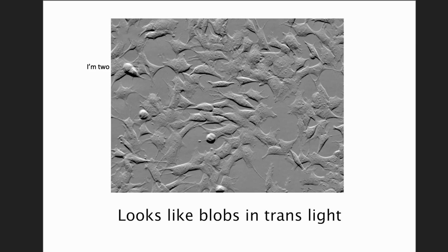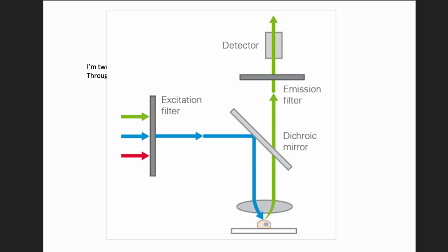So, widefield microscopy is one of the more basic versions of light microscopy. The most basic version, I think, is just using your transmitted light to image your cells. This is the most basic because there's no specificity. All you're going to see is the overall shape of your cell. So, widefield microscopes use LEDs to excite your fluorophores, and it does so by lighting up your entire sample at one time. So, this basically means that the fluorophores on pretty much all of the focal planes in your sample are going to light up at once.